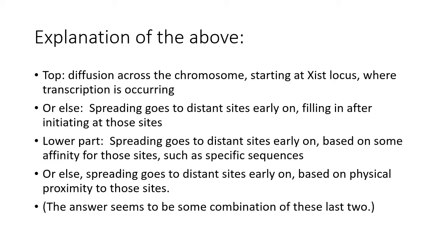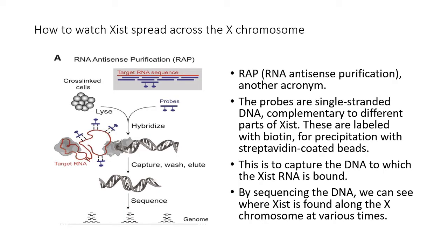Okay, so in the top model, it's diffusion, or else spreading goes to distant sites, filling in after that. Okay, so the answer does seem to be spreading goes to distant sites early on, based on physical proximity because of the chromatin structure and chromatin looping.